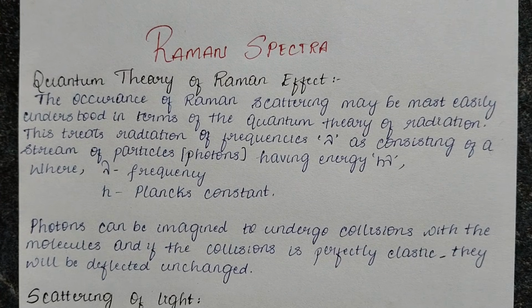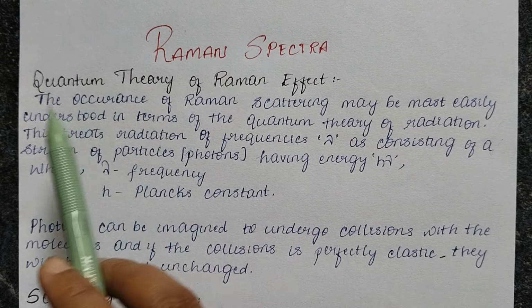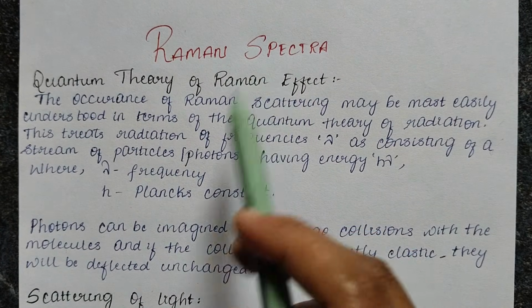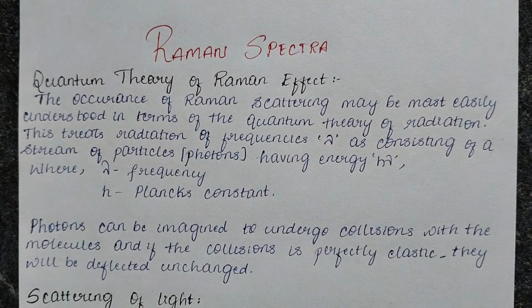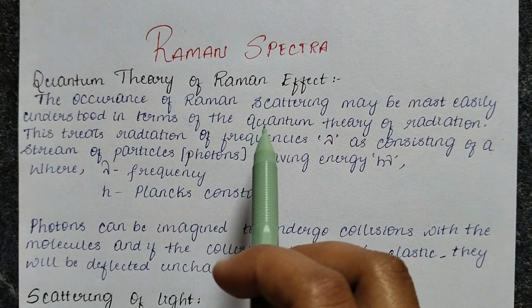Today we are going to discuss an interesting topic, the Raman Spectra. So now let us see the quantum theory of Raman Spectra. As we know, this Raman Spectra was invented by C.V. Raman, who is one of the most famous and valuable, precious scientists in the world. And it is proud to say he is an Indian.